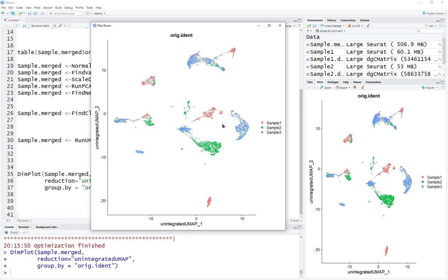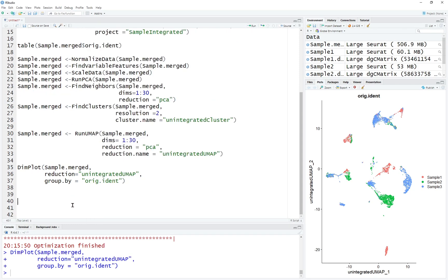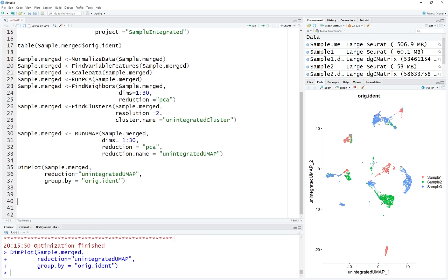So we want to integrate them together — for each cluster, we want to have a composition from all three samples. Something like a well-mixed cluster looks much better. But separate clusters can create false positive results, which is something we don't want. In Seurat v5, the integration is very straightforward — just one line of code.